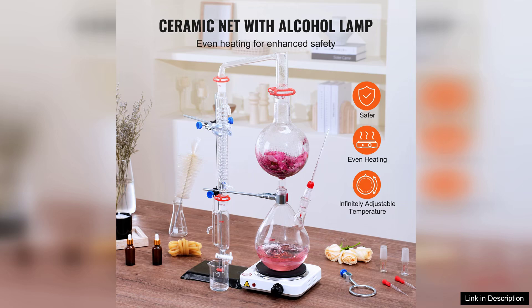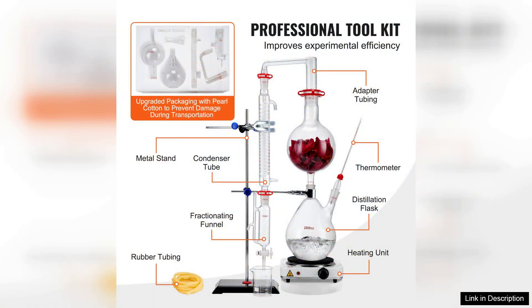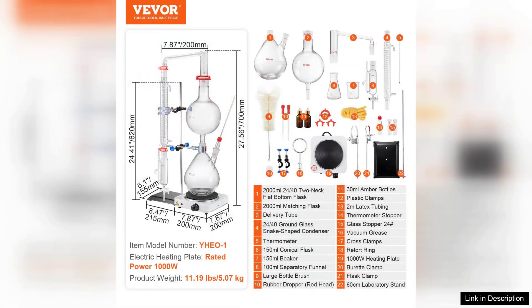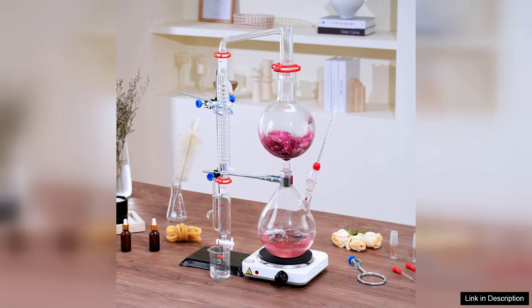I found the setup straightforward with clear instructions that made the initial assembly a breeze. One of the standout features is the efficient cooling system, which significantly enhances the distillation process. I was amazed at how quickly I obtained a high quality essential oil from my chosen botanicals. The resulting oil was pure and had a wonderful aroma, confirming the effectiveness of this kit.